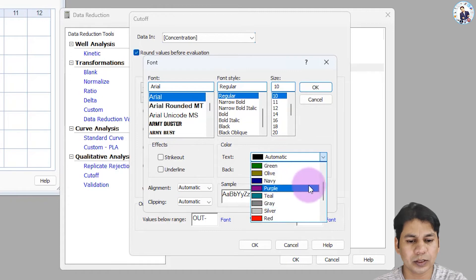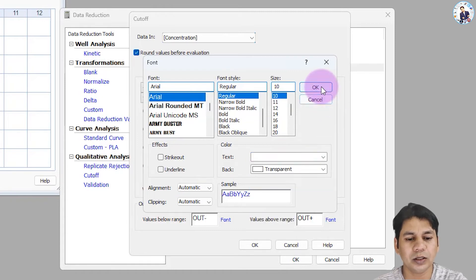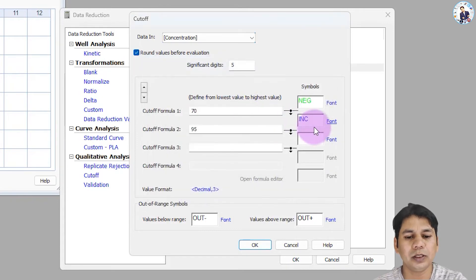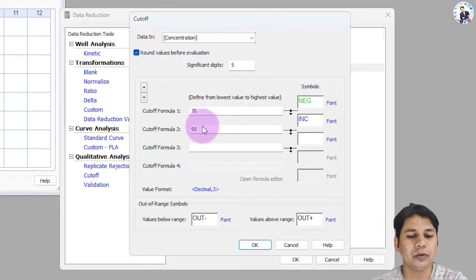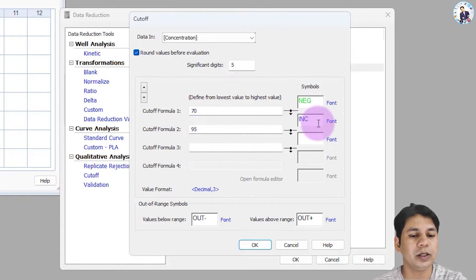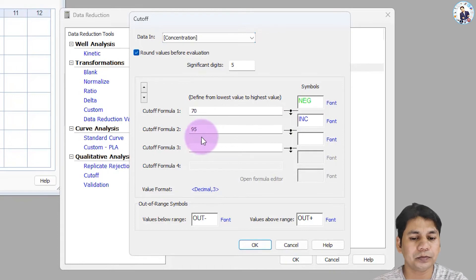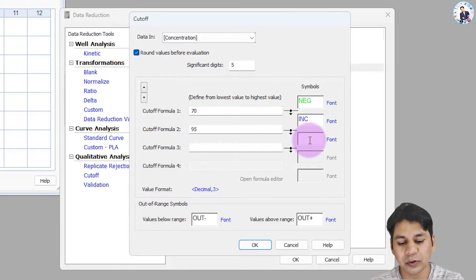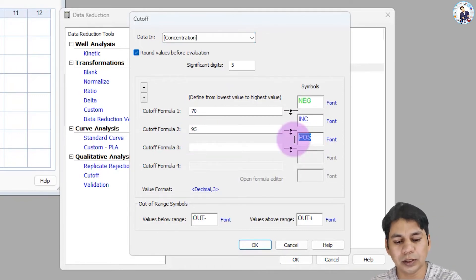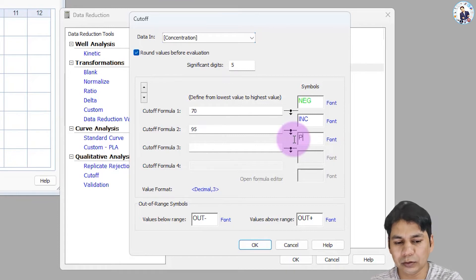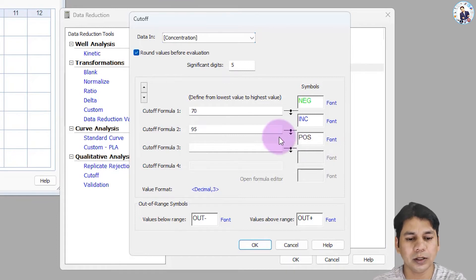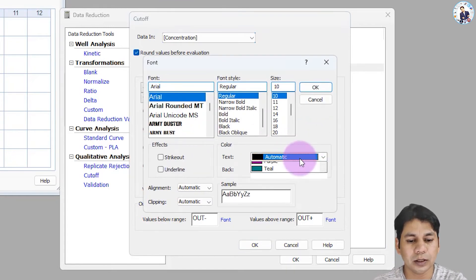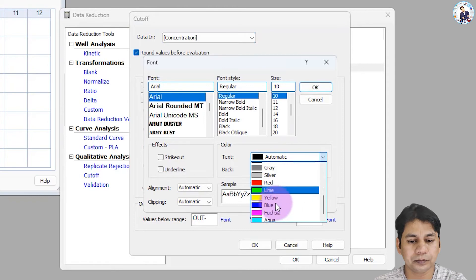I am assigning blue color for the inconclusive result. If the value comes between 70 and 95 pg, it will be an inconclusive result. For values greater than 95 pg, the sample will be positive, so I am entering that value and changing the color to red.